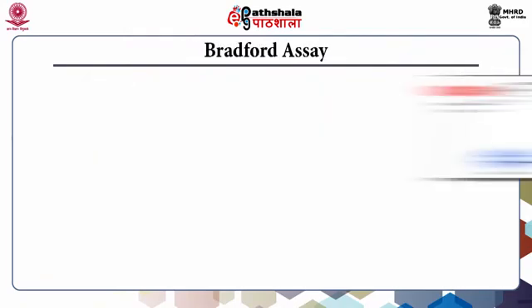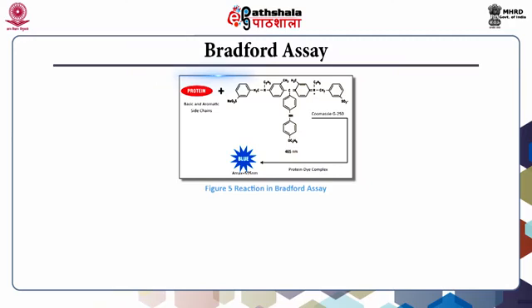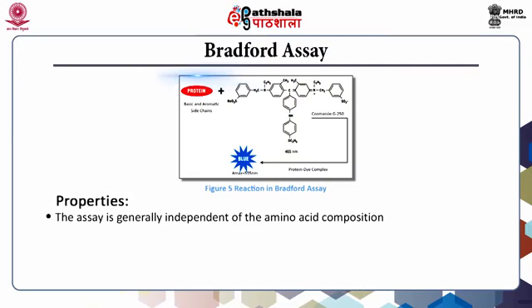The basic principle of this assay is that a dye named Coomassie brilliant blue binds to the protein under acidic condition to form a blue colored complex that absorbs strongly at 595 nanometer. This method is different as it is independent of the amino acid composition.